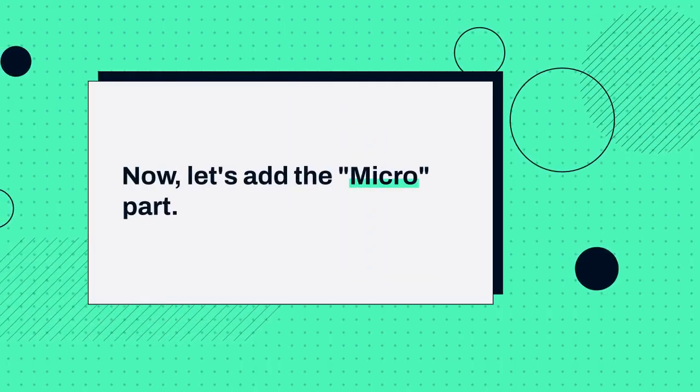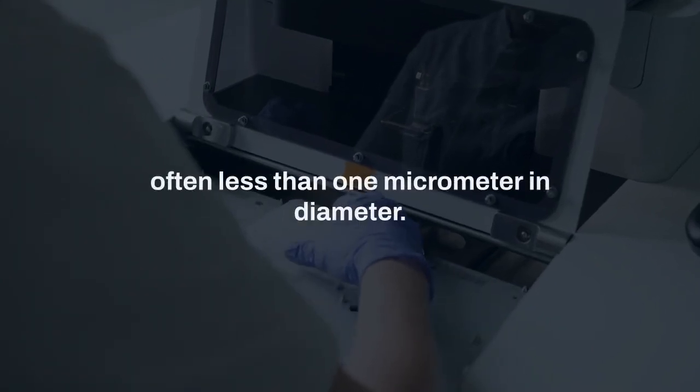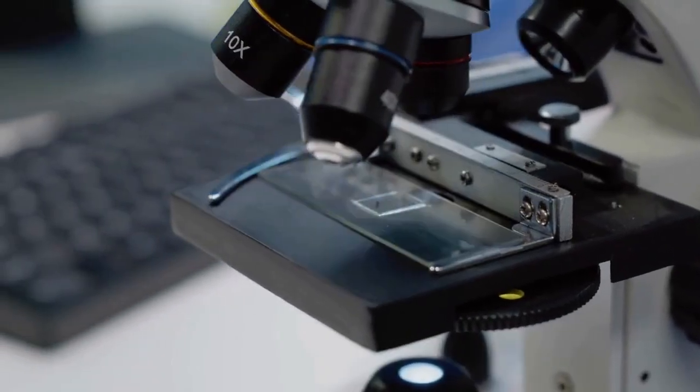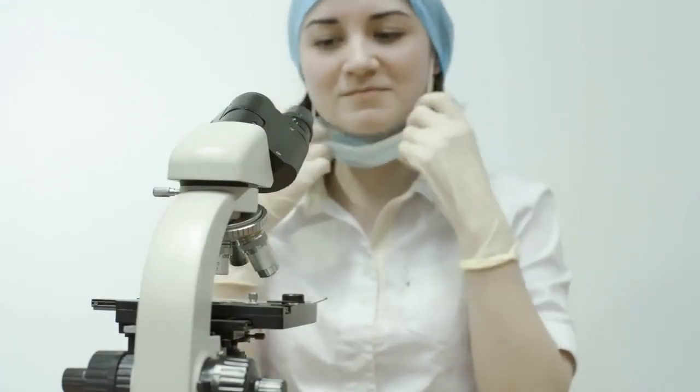Now, let's add the micro part. This simply means we combine the Raman technique with a high-powered optical microscope. By doing this, we can focus the laser light down to an incredibly small spot, often less than 1 micrometer in diameter. This allows us to analyze a very specific point on a sample, like a single particle, a defect in a crystal, or even a part of a biological cell.